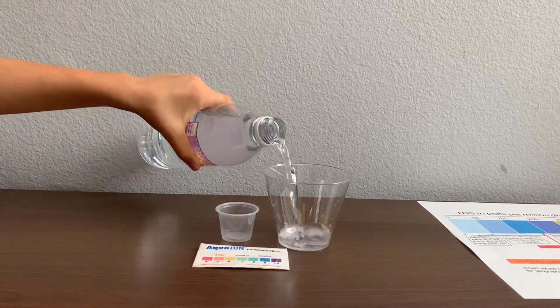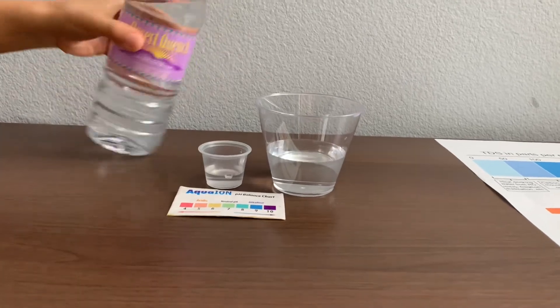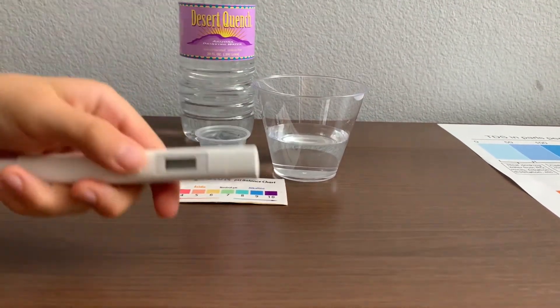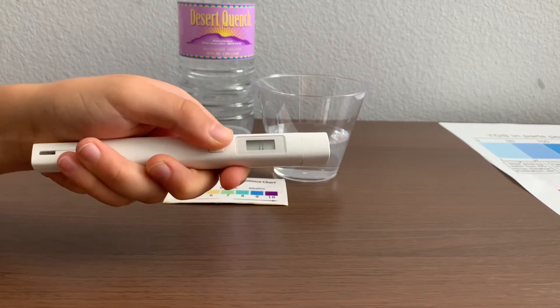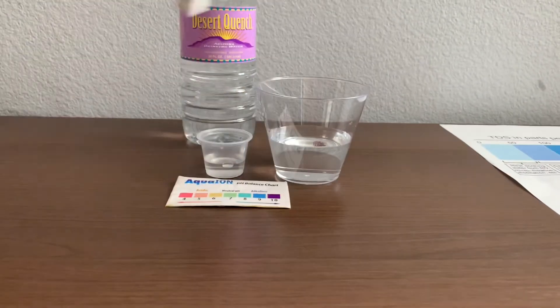Let's pour some water in. First, let's test the TDS level. Turn on your TDS tester, make sure it says zero, and put it in.